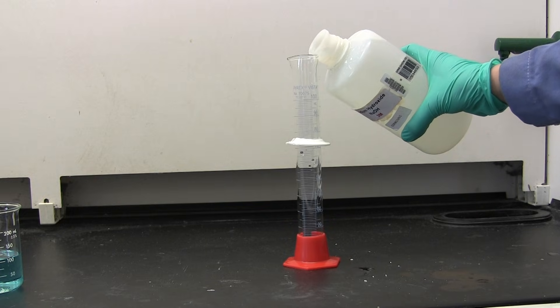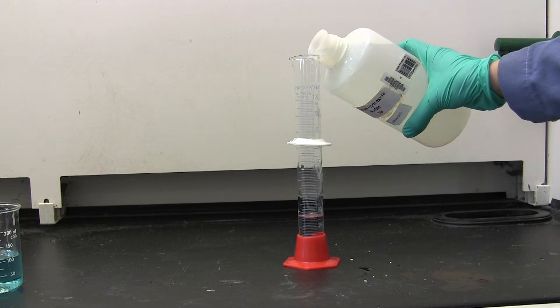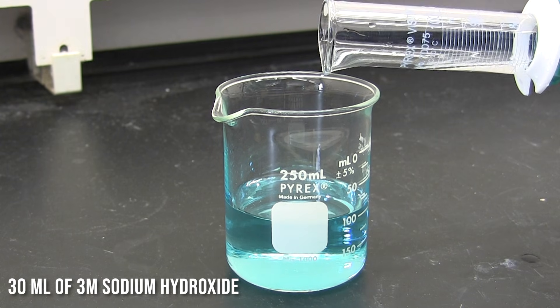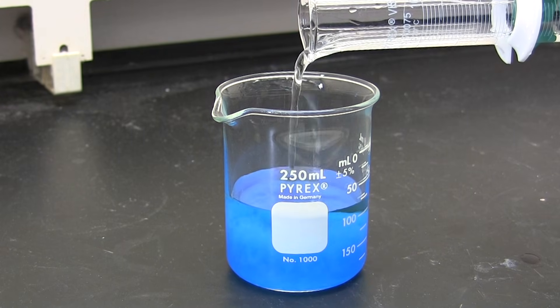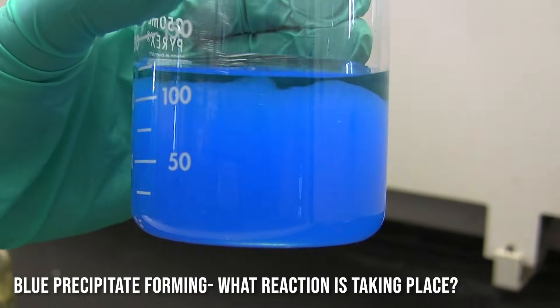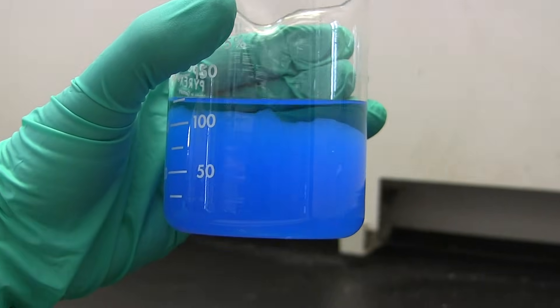Next, we are going to add in 30 ml of 3 molar sodium hydroxide. We get a darker blue precipitate forming, as you can see — it's kind of gelatinous, a little interesting.